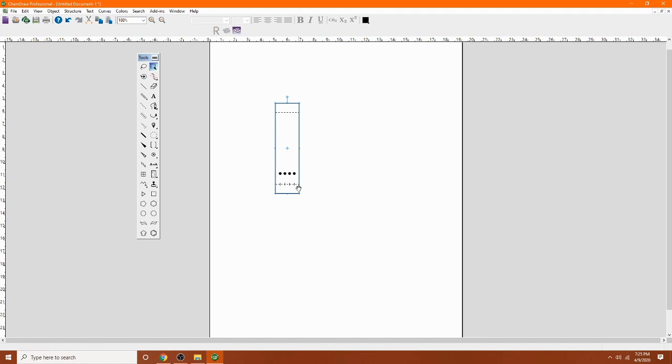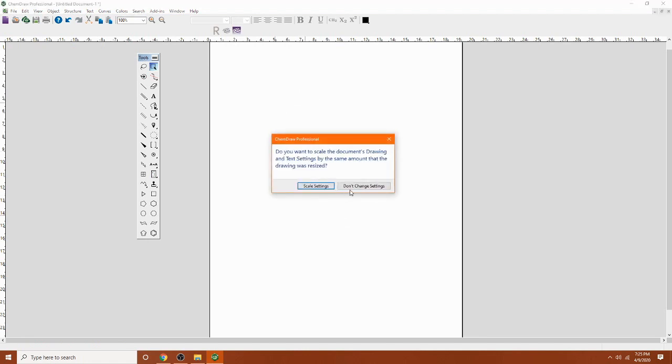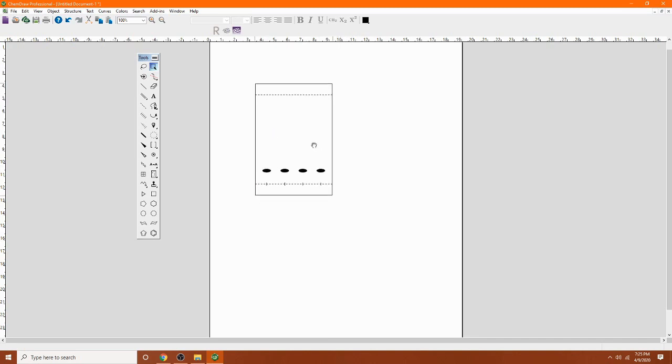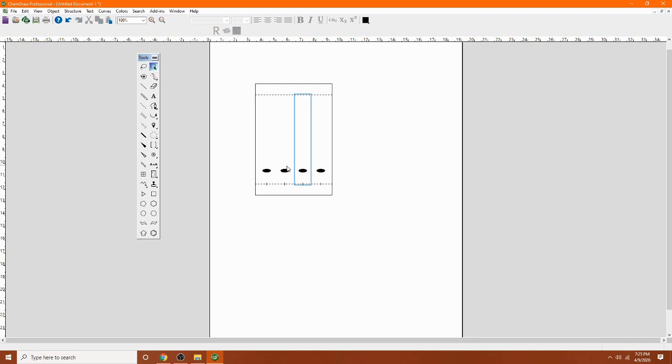My TLC plate is skinny, so I'm just going to make it bigger. So now I have 4 lanes, bigger TLC plate. If you glide the mouse over it, you see a rectangular blue box here. So these are the lanes.